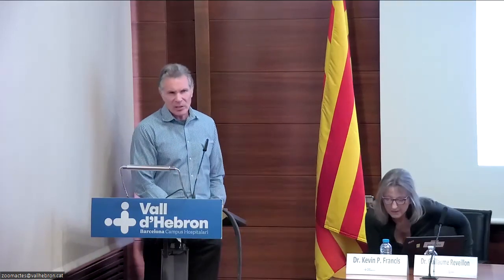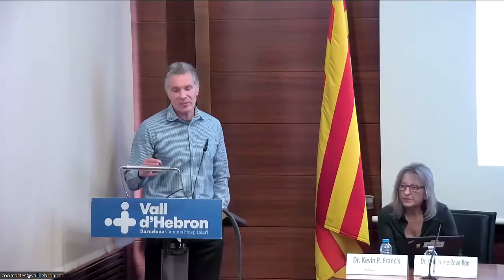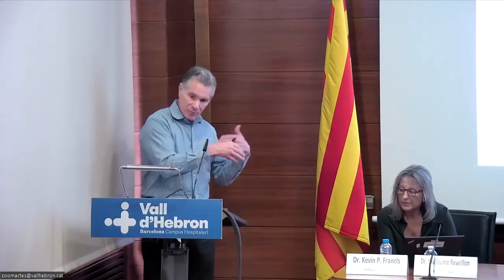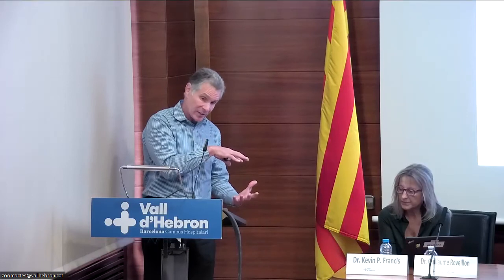We actually used to sell one of those cameras. Our systems use integrating CCDs. They're back illuminated. Basically, they accumulate the signal over time. So as you capture the image, rather than keep showing it in real time, they accumulate the image over time and show you the final image. And that's the most sensitive way of collecting data.